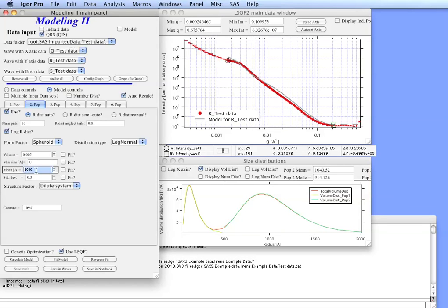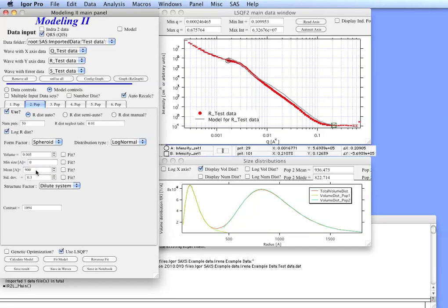Now we probably need to go slightly smaller. Let's make it 900. And we should be able to now use the least square fitting to optimize the parameters.